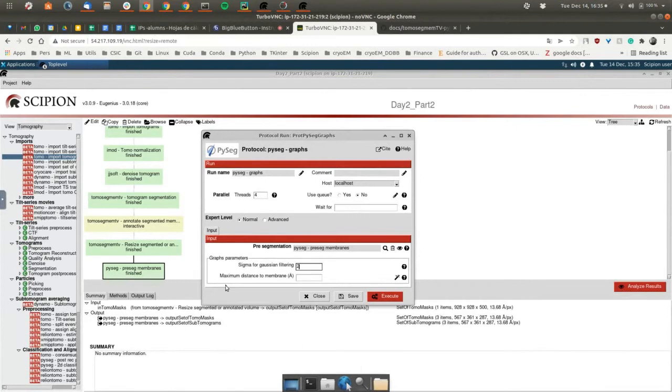This wizard will automatically bring you the value that you used before when you were determining the thickness of those areas. So by default, we expect this value to be the same, but you can play with it and read the explanation. And also in the documentation, I have added some notes in case you have to tune it.